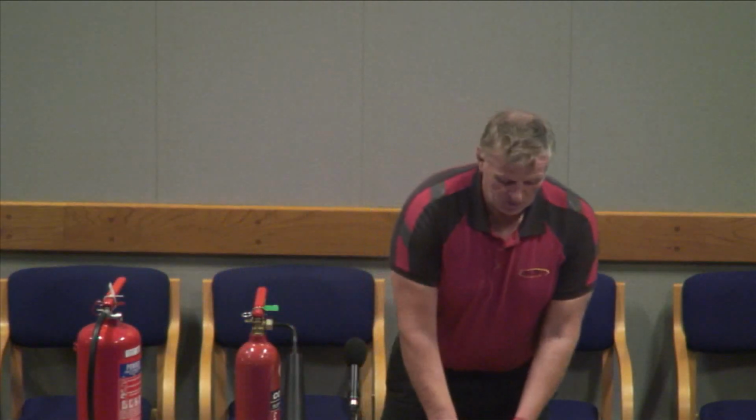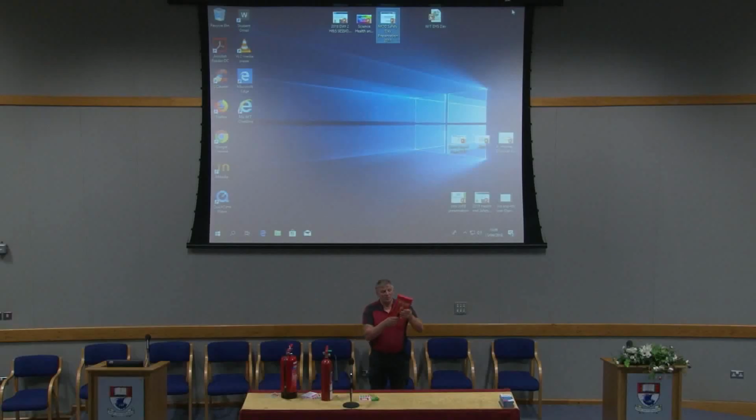Right, the next one we have inside there, and also again, it's about awareness. Read the extinguisher, read what's on there, read the signs. The next one we have is a blanket in there. Very good with the fire equipment. Every lab has got a blanket. It'll be on the wall, with straps like that. You pull the straps, out comes the blanket, down like that.